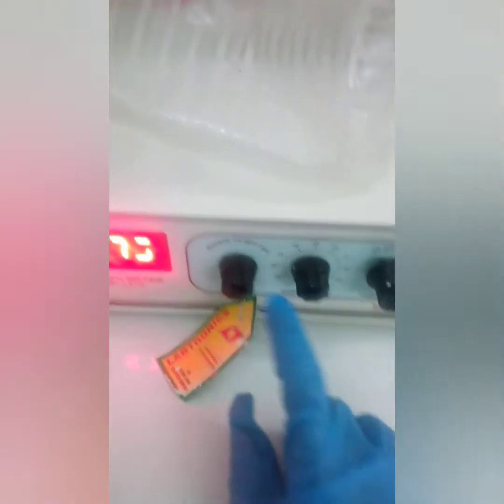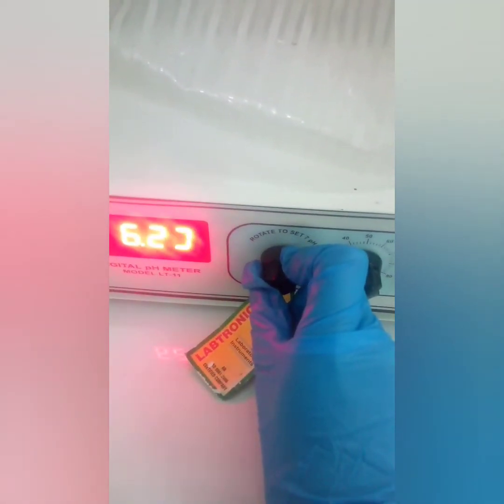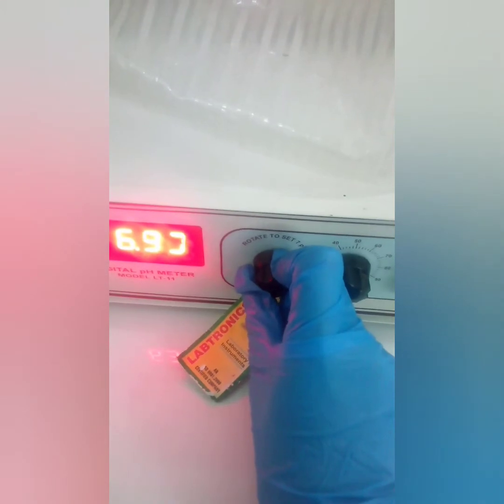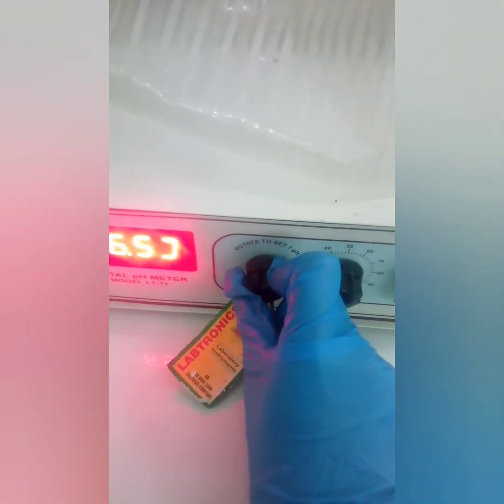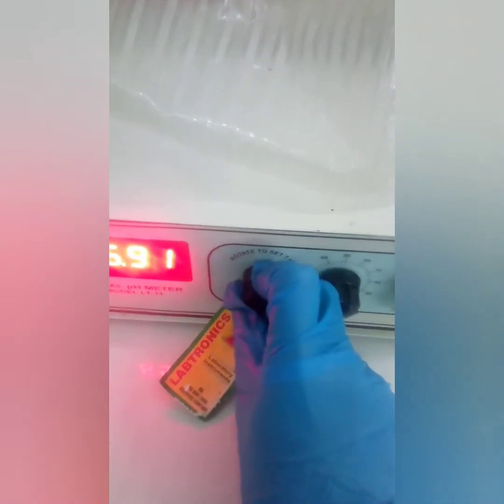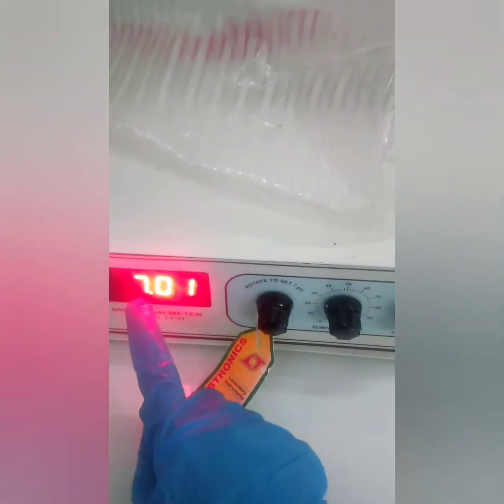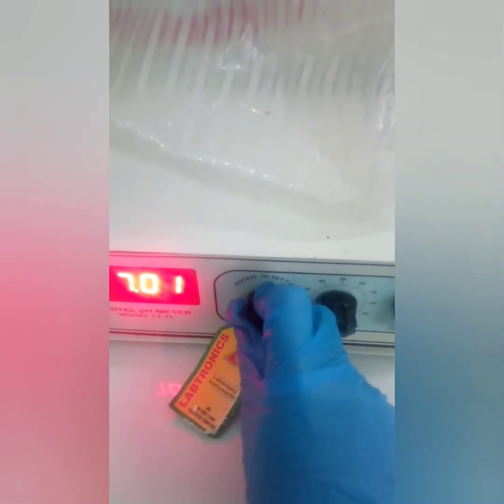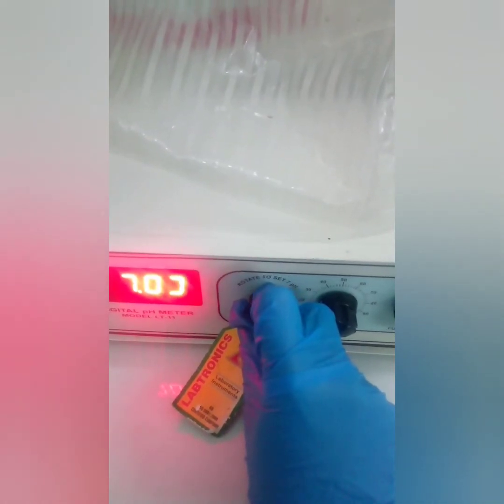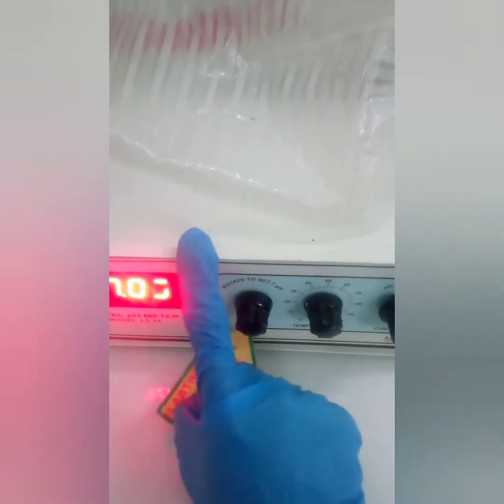From here you have to calibrate to set the pH to 7. That means the neutral pH. We know that water has a neutral pH, neither acidic nor basic. So I have already, you see here it's 7, the pH is 7. I have already calibrated the pH of this instrument at 7. I have set it at 7.